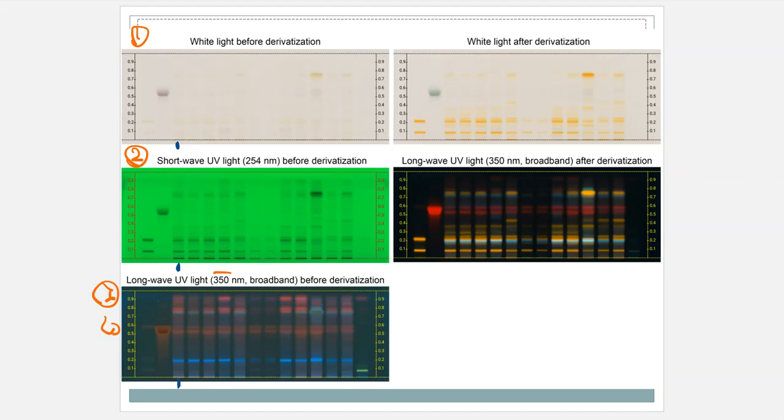Look at this, very faint, hardly anything there. I maybe see a little yellow line here and a yellow line there. I see maybe one up here, but you know, anything in between, very difficult to see. So if I go to UV light, then all of a sudden, I see something here and here and here and here and here and so on. So it does give me the idea that there's more components that are present, more things that I've separated out from each other, more things that I need to report on.